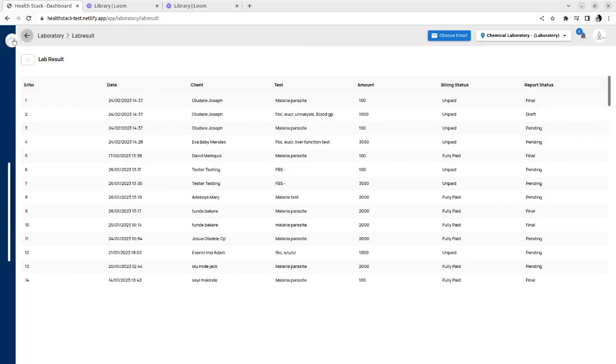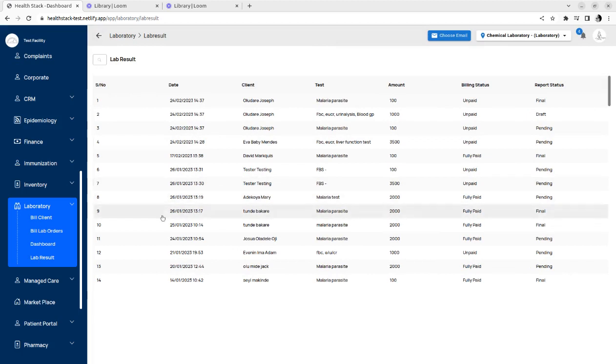So I've walked you through what a laboratory module does. I've walked you through how to bill clients and how to write out test results for a client.